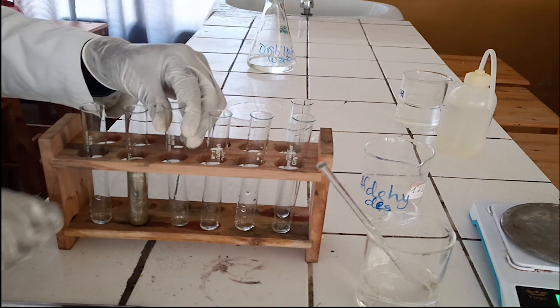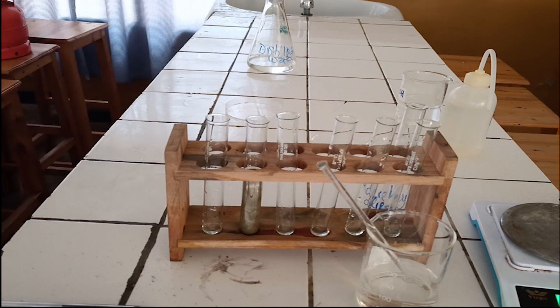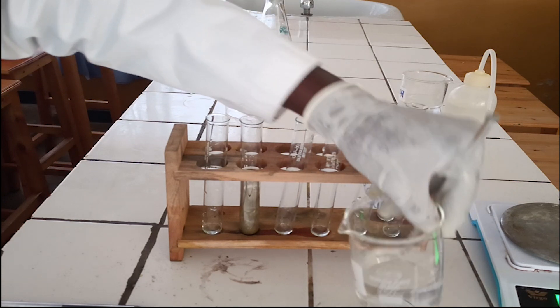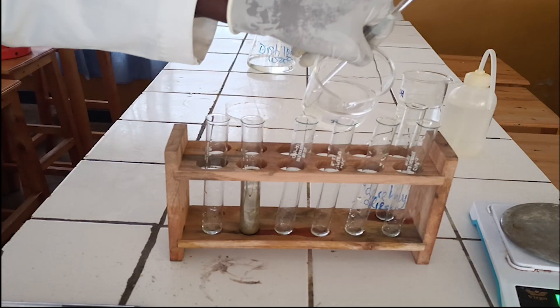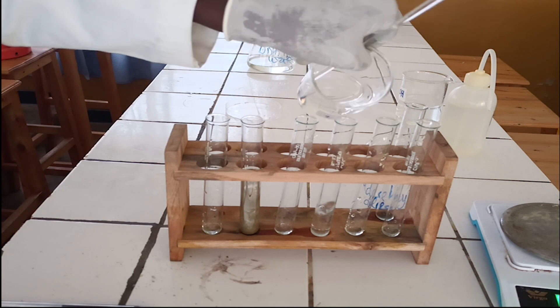Tollens Reagent is used to test the presence of aldehyde functional group in organic compounds. To carry out the test, you add a few drops of the aldehyde or ketone to the freshly prepared Tollens Reagent. If no observable change is seen, warm gently in a hot water bath for a few minutes.